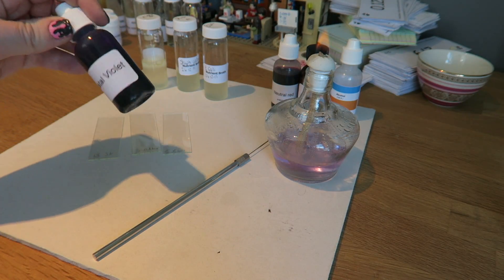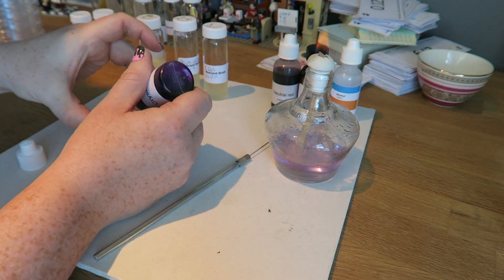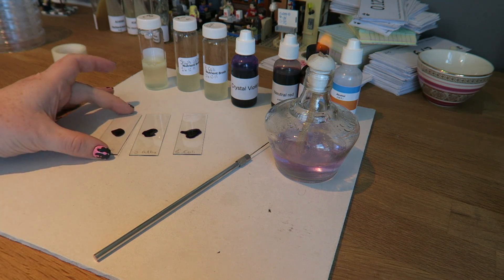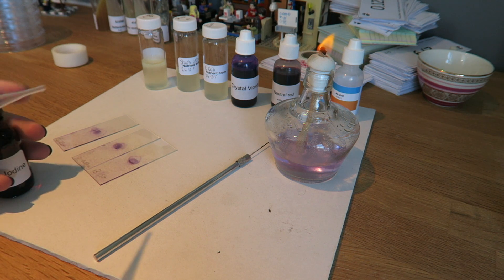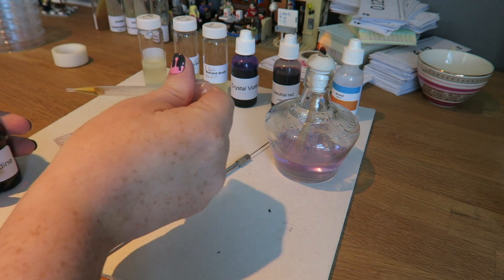I'm now going to add two drops of crystal violet to each of my dried smears and leave it to dry for two minutes. Once that's dried, I'm just going to rinse these with tap water and allow them to drain. We can then put a drop or two of Gram's iodine on and again leave it to dry for two minutes.